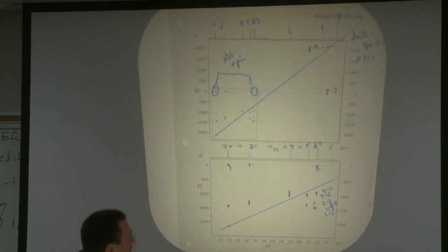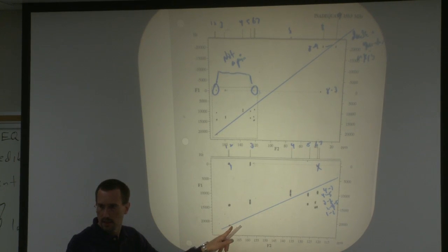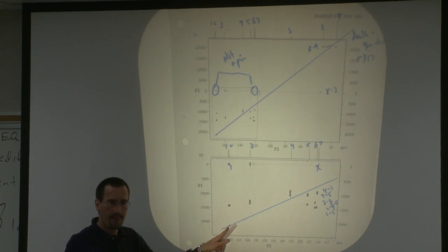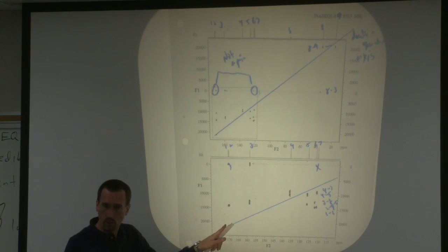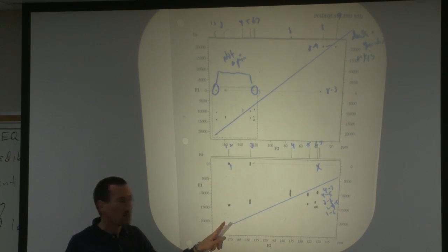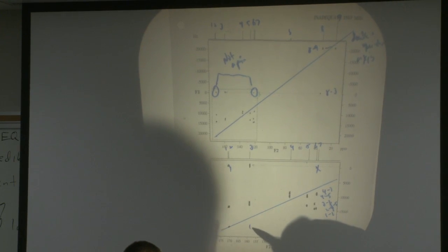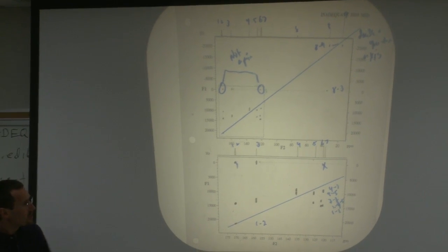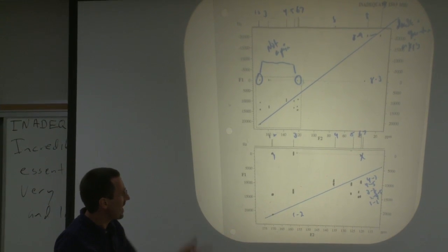And then what's going on over here? That's got to be a 1 to 2 pair. If 1 and 2 weren't giving a cross peak, you wouldn't see a spot here. So even where they're really close, we're seeing a 1 to 2 cross peak. So you're all set to go ahead and tackle this on your own.